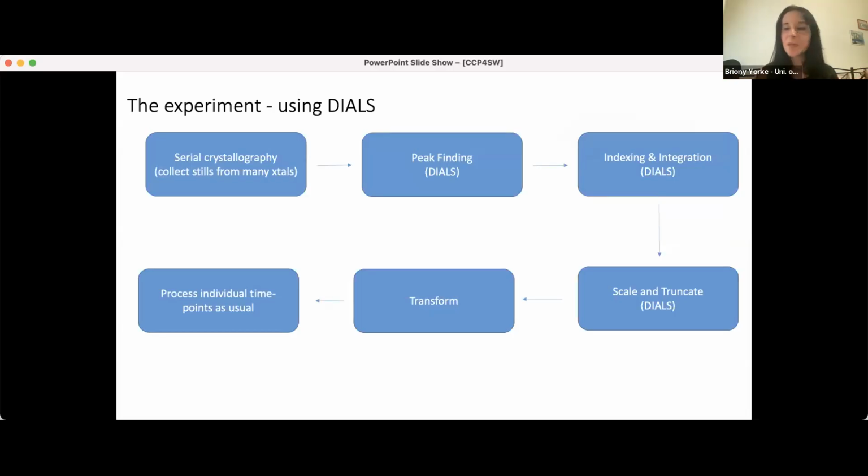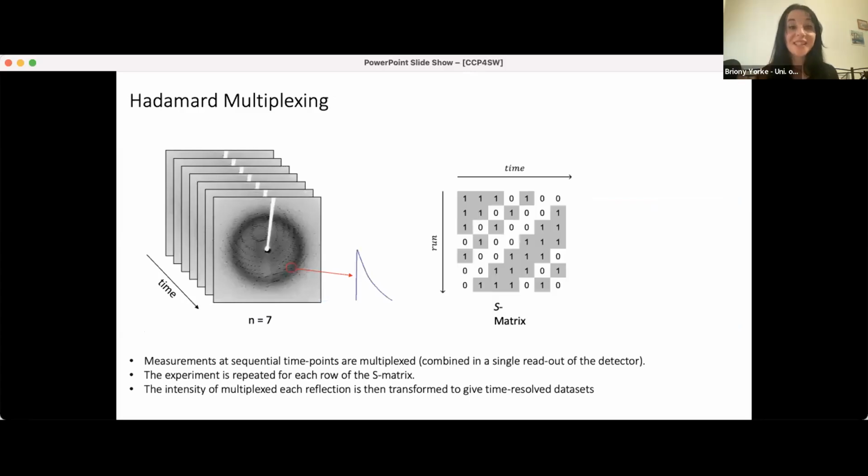So we get a balance because we've got lots and lots of different sources of error in this experiment. When the error is mostly on our detector, then we would get a much better advantage in our signal to noise ratio by doing this type of averaging. But in our experiment, as you correctly stated, we've got Poisson noise from our shot noise, and we also have random scattering from the crystal. We have all different kinds of sources of noise. So you are very correct. We're not actually looking for that increase in signal to noise ratio of our transformed data, but just to allow us to see those spots and measure intensities with more certainty.